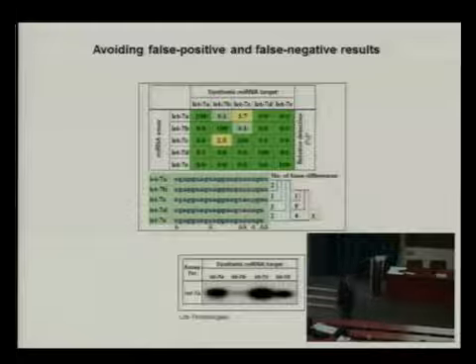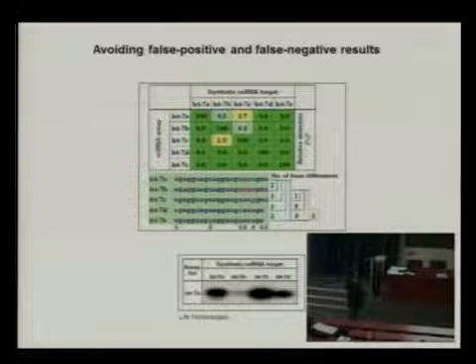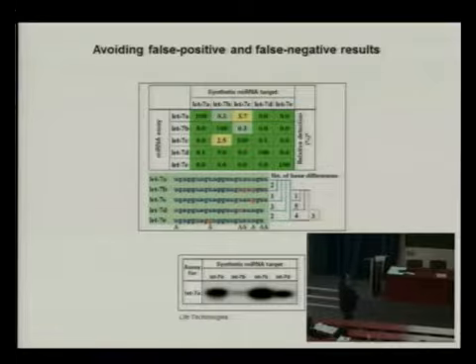So this problem can also be circumvented by using the qPCR-based method, which I just introduced, and here you can see the result of that. This is not our work, but it's published by Life Technologies. So the LET7A assay detects LET7A 100% and LET7C only 3.7%.